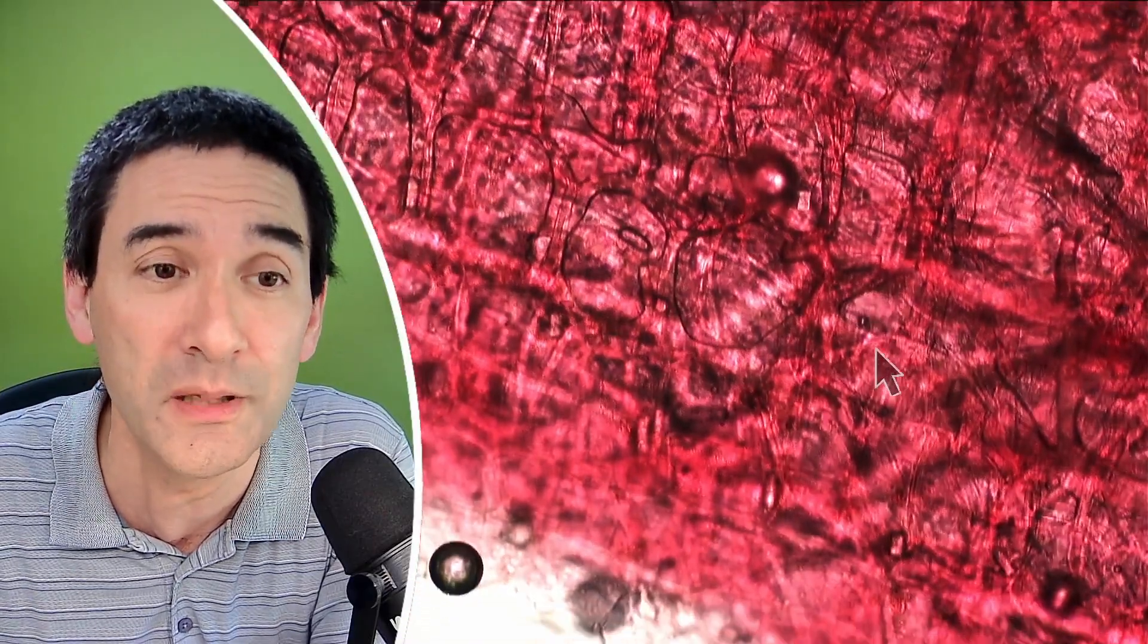But when you add, for example, oil to paper, then the paper also becomes translucent, it allows light to go through. And the similar thing also happens with the onion skin. If you add oil, then it will also become a little bit more translucent, allowing more light to go through.